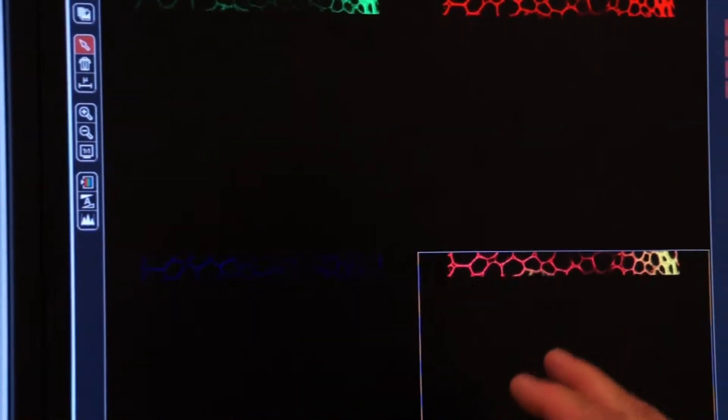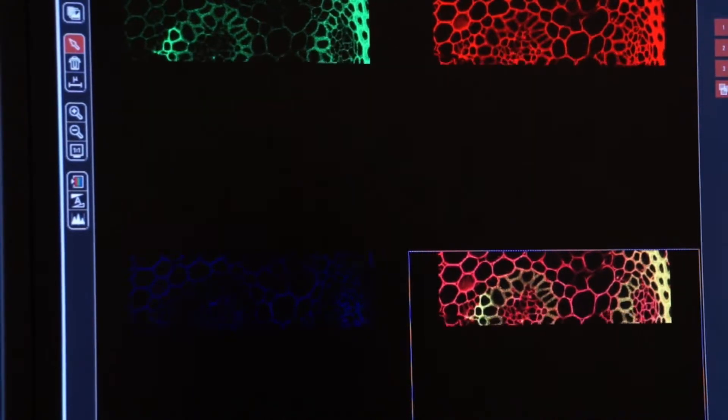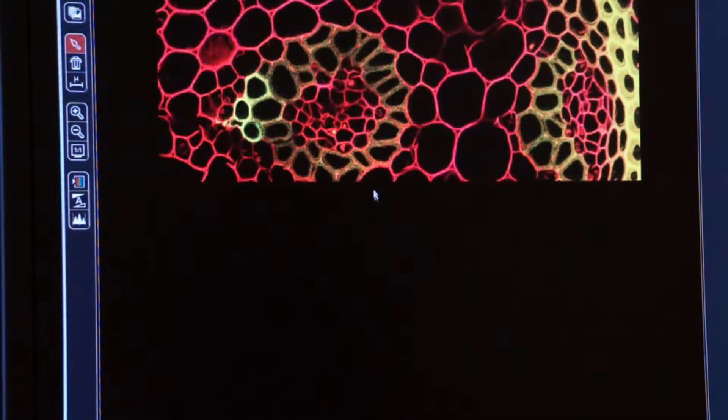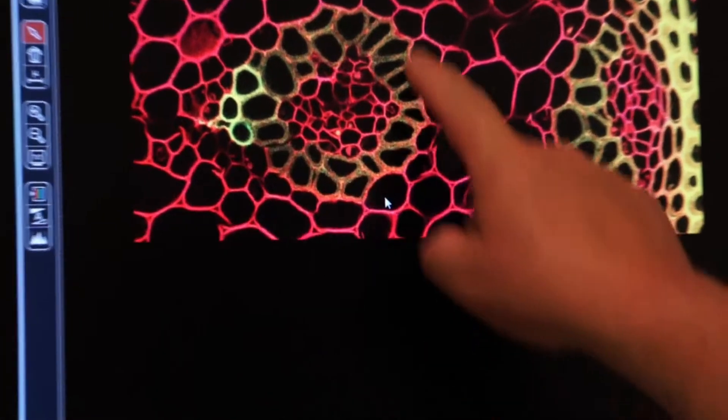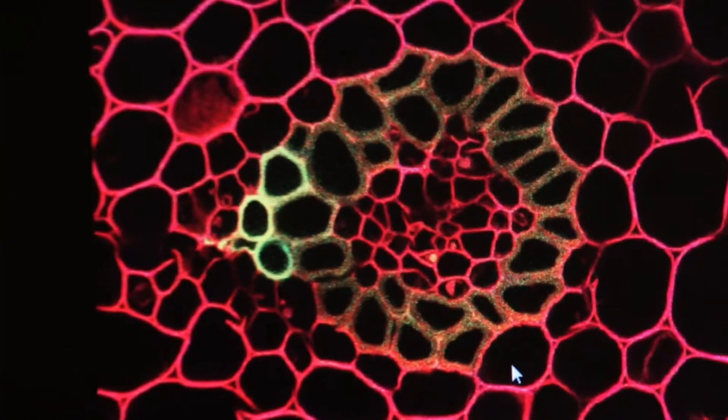Again, it's slower. Why? We're scanning each line five times. But when you look at the result in image, you'll see that a lot of the noise has gone away and a lot of the pixelation has gone away.